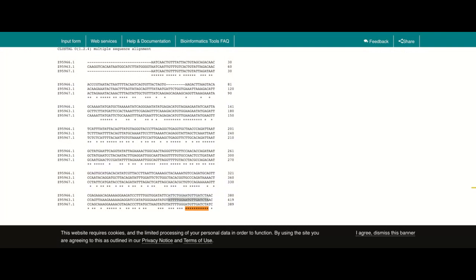Hopefully this was fun to you. It's a real life application of how you use these bioinformatics tools. I did this a lot. My God, this is my favorite thing from my PhD, which was designing PCR primers, so all the align things and then find where they agree. And I wanted to amplify strawberry DNA.